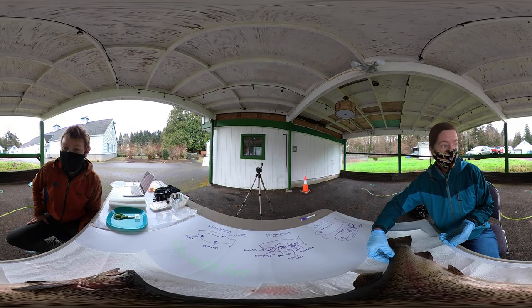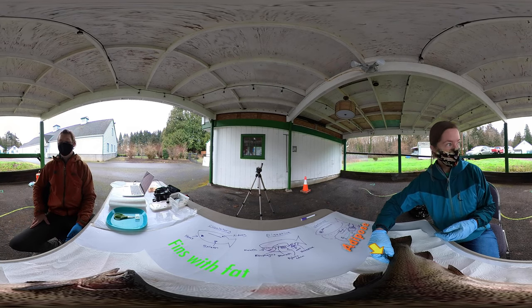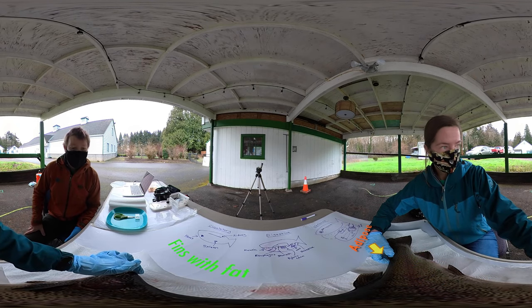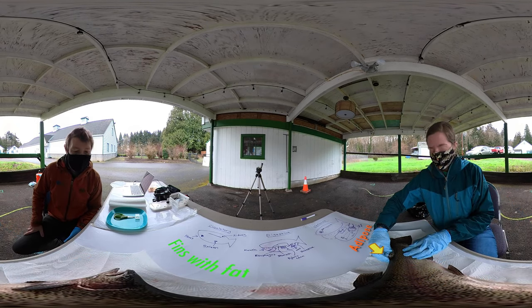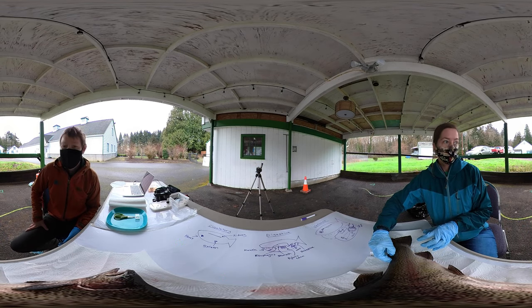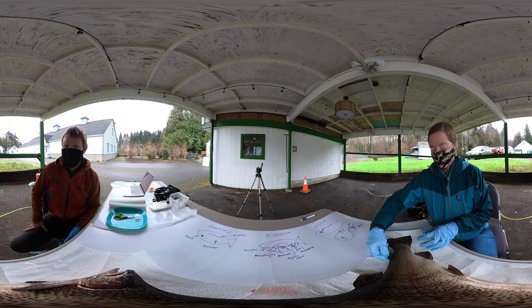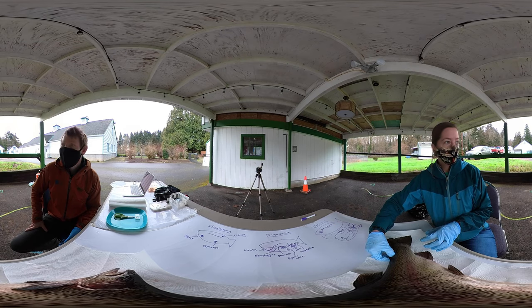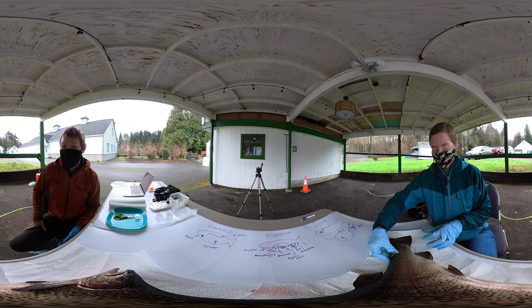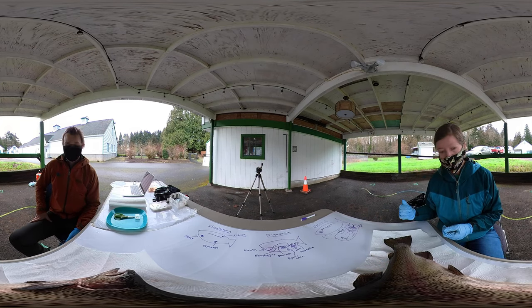This one is called the adipose fin, and adipose is a type of fat. It has adipose in different parts of its body too — it actually has some adipose fat right up here in its snout. This one gets cut off at the hatchery and they call it marking. So then we'll know if a fish was born in a hatchery or not. That can let a fisherman know if they're allowed to keep the fish or if they need to throw it back. So this has no bones inside — it's just a piece of fat.